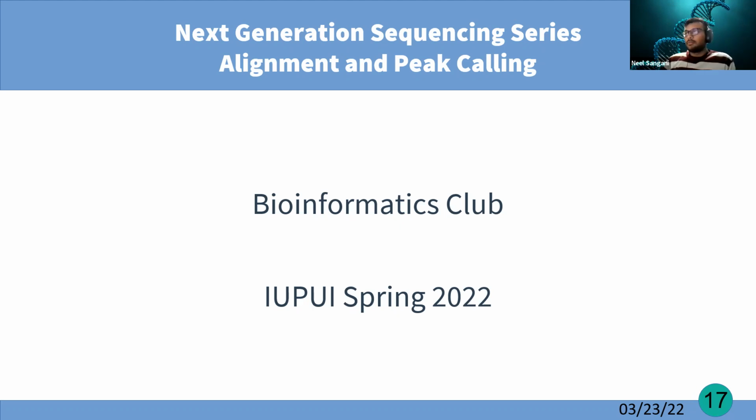I've received multiple requests from students who were unable to attend the workshop due to classes and homework commitments. So I have decided to quickly go over the workshop that we did last week and give you the keynotes that you need to know for the pipeline.